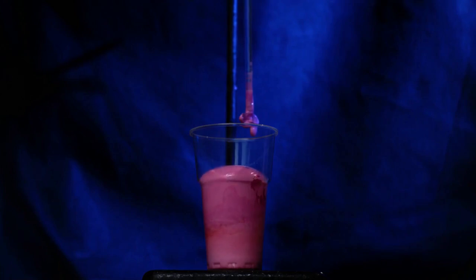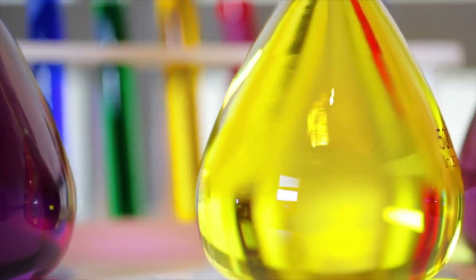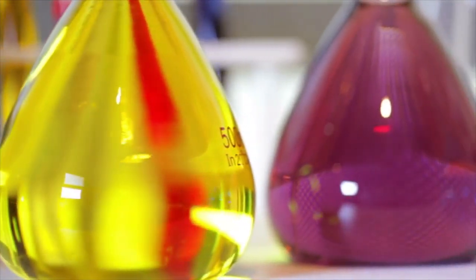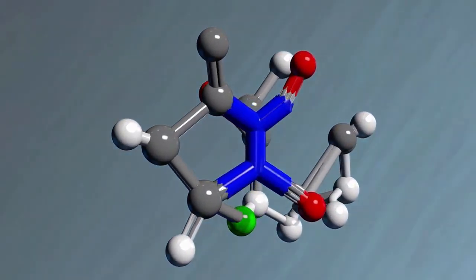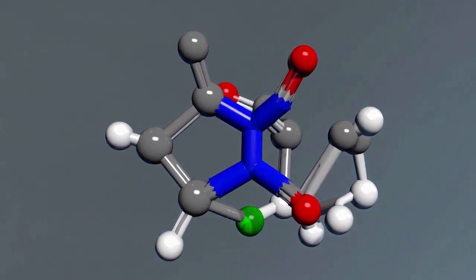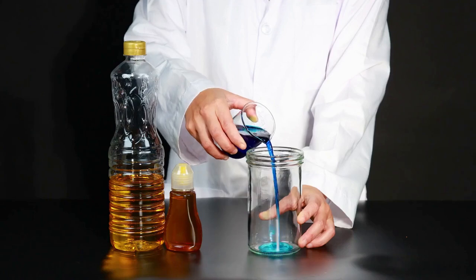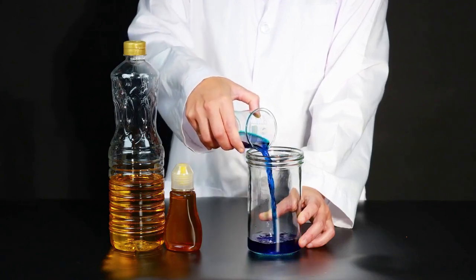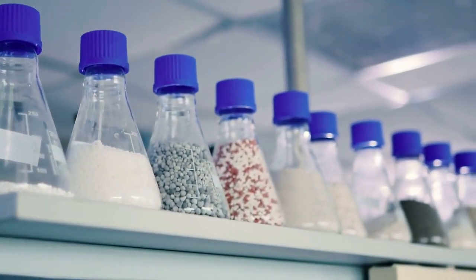In simple terms, gas chromatography separates compounds in a mixture by turning them into a gas and passing them through a long, thin tube called a column. Molecules that are volatile, meaning they have a low boiling point, travel through the column quickly. However, many important molecules, like sugars, amino acids, or certain drugs, are not volatile. They contain polar functional groups, like OH or NH2, which act like sticky hands, causing the molecules to cling to each other and to the column. This makes them difficult to vaporize and results in poor, broad peaks or no peaks at all.